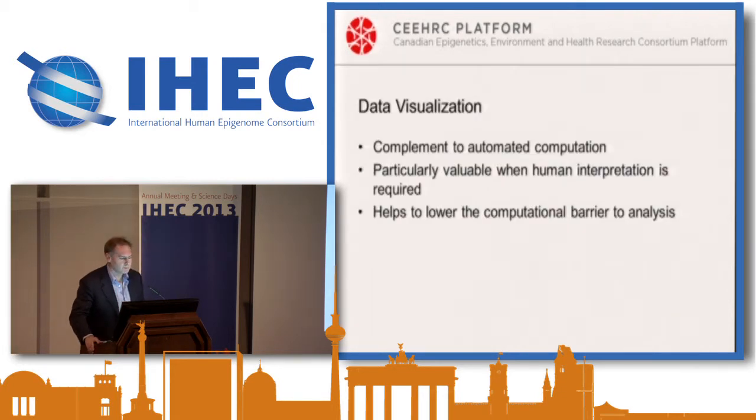Okay, so our goals in terms of trying to visualize the epigenomic data, of course, clearly we want to complement an automated computation, and I think humans are still pretty good at identifying patterns and features in data that computers aren't. So human interpretation is still an important aspect of what we do. And it helps, of course, make the data accessible to a much larger group of people.